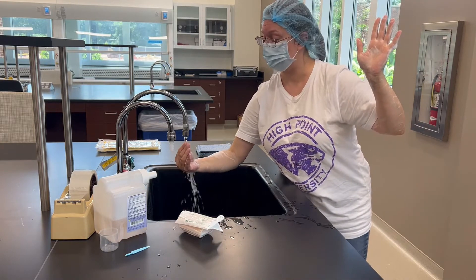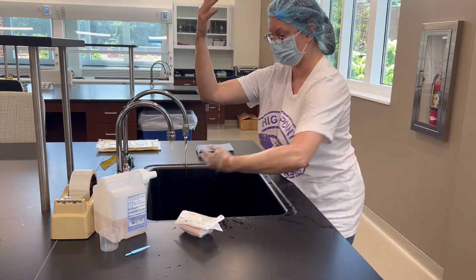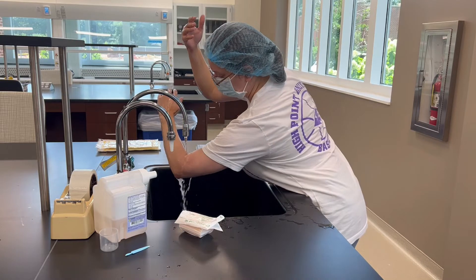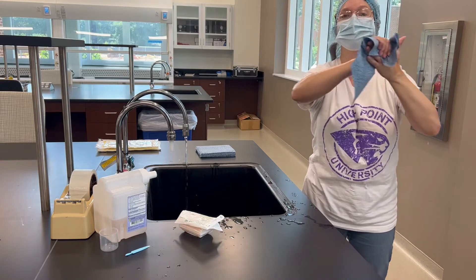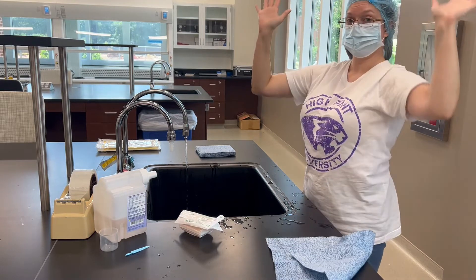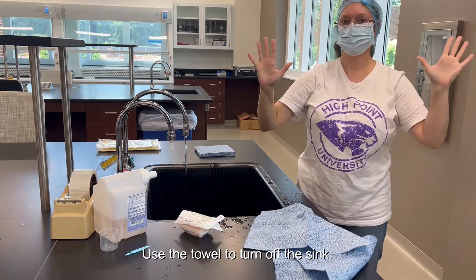Done — second hand. Then rinse. Again, fingers do not go back — you're going to go one direction and the water drips off your elbows. Drying: one towel per hand, and again one direction — go down. Hands done.